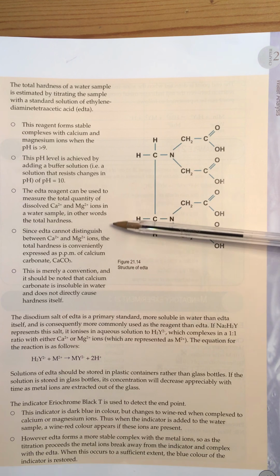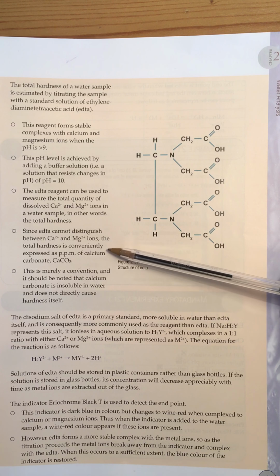So what this means is that EDTA doesn't react with only calcium ions or only magnesium ions. It reacts with both. So if there are calcium and magnesium ions in the water sample, the EDTA will react with both. It doesn't distinguish.